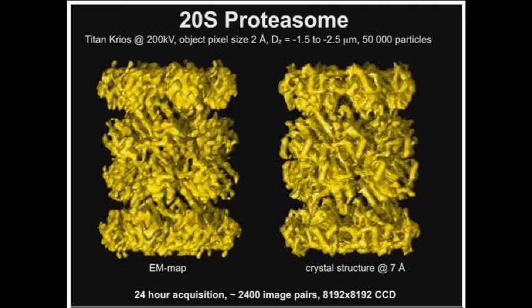Yeah. Has anybody tested the cryo system with 2D crystals diffracting at high resolution? How well does the instrument compare in terms of stability, in terms of data collection, to, let's say, a JEOL 3200? That's a good question. I can't comment. I'm not a JEOL user. I guess Hans is more familiar with JEOLs, and also Henning from former times. I'm not really able to give you a statement on which is better. And of course Werner is also a JEOL user.